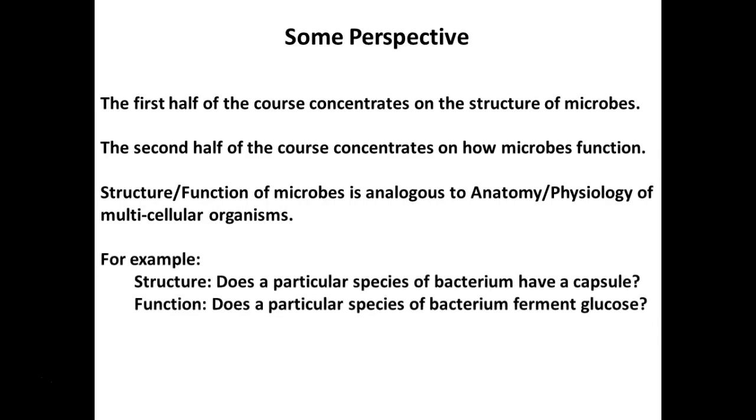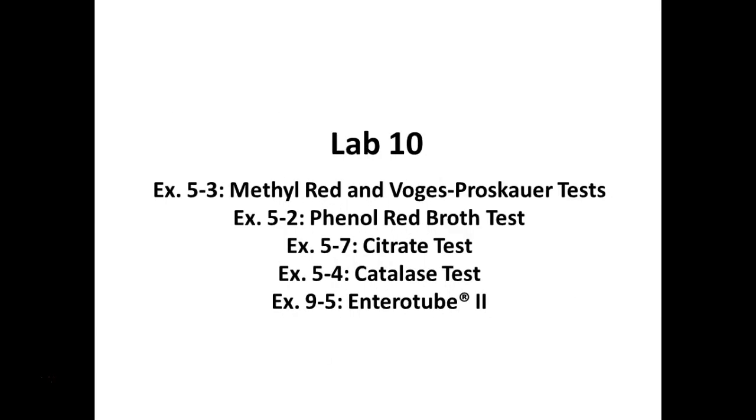So structure, things like, does it have a capsule, which we've repeated a little bit with our unknowns. We've looked at structures and stains and stuff again. And then now we're really asking, what can they do? So we're asking questions like, can they ferment glucose? And you asked that question actually a couple of times today about your organisms.